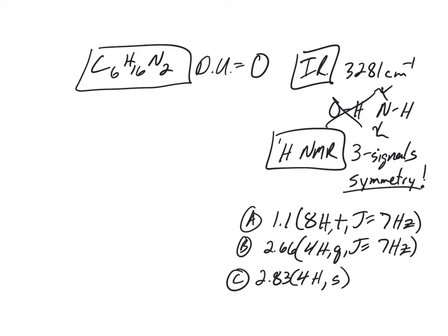So is this peak really worth 8 hydrogens? No. The NH peak is wrapped up in here. That's what this hint is saying: the peaks are overlapping, and there's an NH, a broad resonance, in here. How many NHs do you think there are? If I did 1 NH, that means this peak is worth 7 hydrogens. How could you ever possibly get 7 hydrogens to be equivalent?